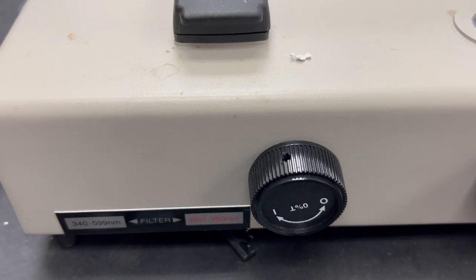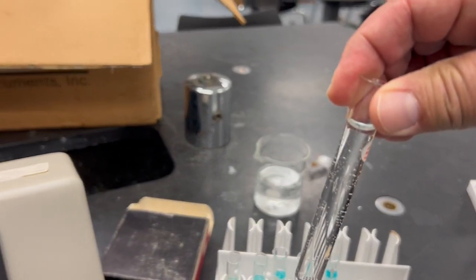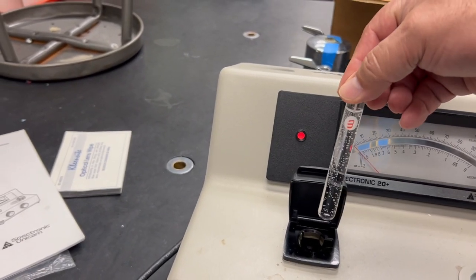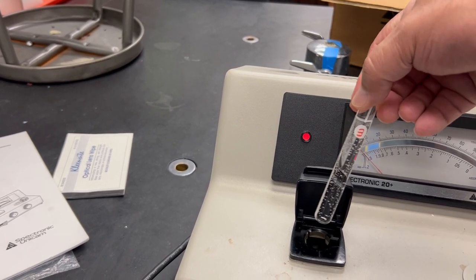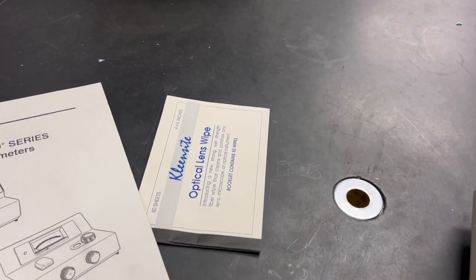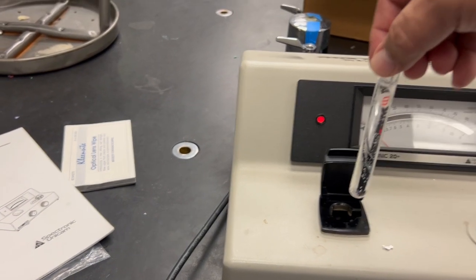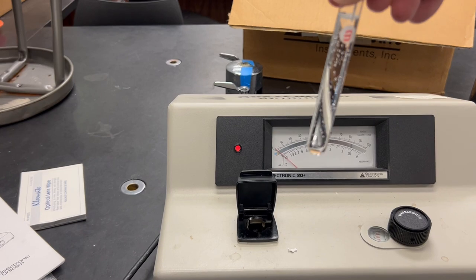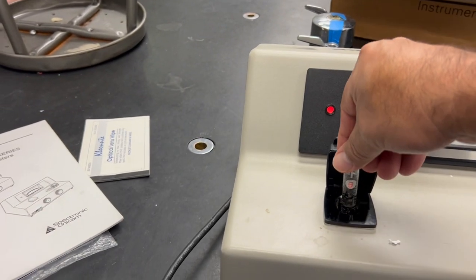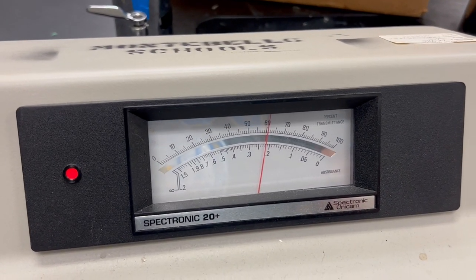Once zero is set, get your water blank — this is just water — and put it in here. Point the frosted arrow toward you. You can clean the cuvette with a lens wipe first, because if anyone touches it with oils, those oils could absorb some light. Then go ahead and put it in — it fits nicely — and close the lid.